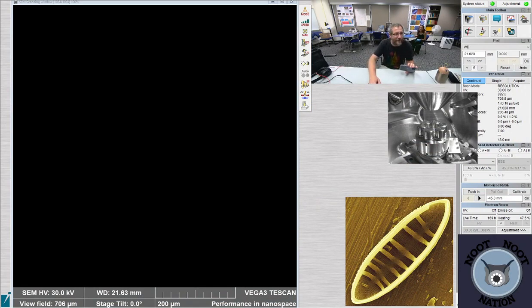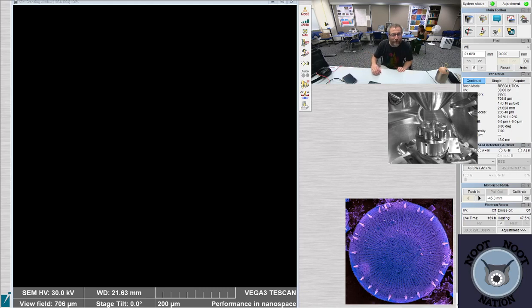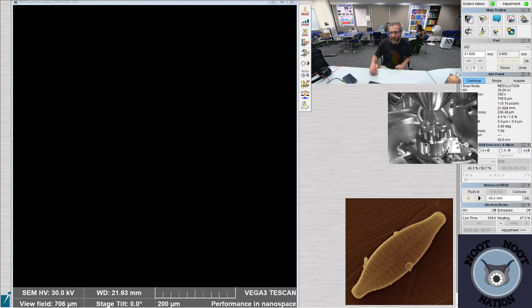Now they can hear us. And Laura's sitting back there because she's going to prep some samples, and I'm going to put them on the droid cam so you can actually see the whole process. First she needs to come take the samples out of the SEM. It's ready, yes. So this should be all set up. So you can see she's got a screwdriver.